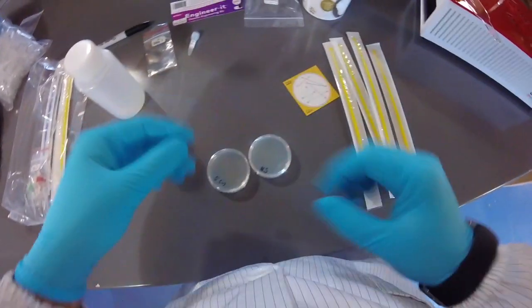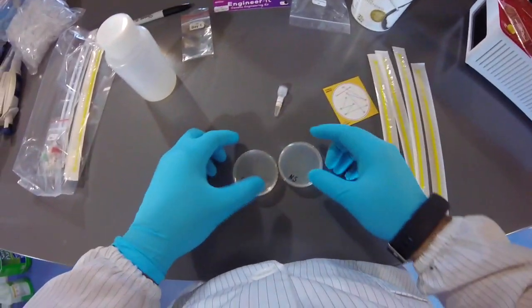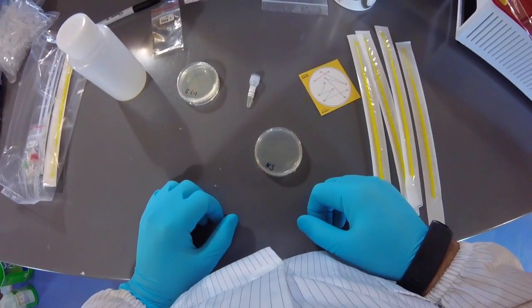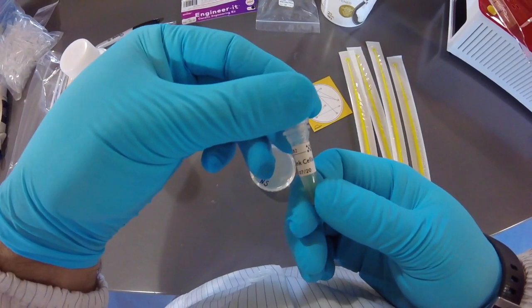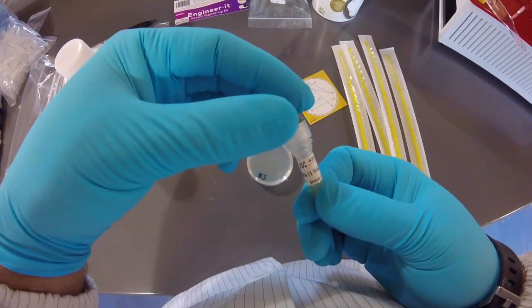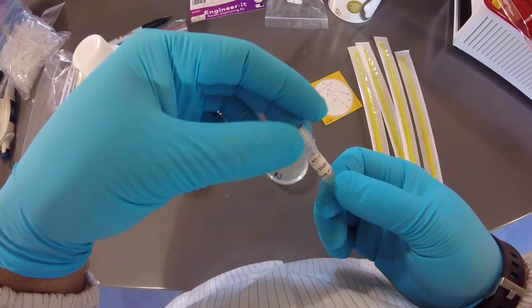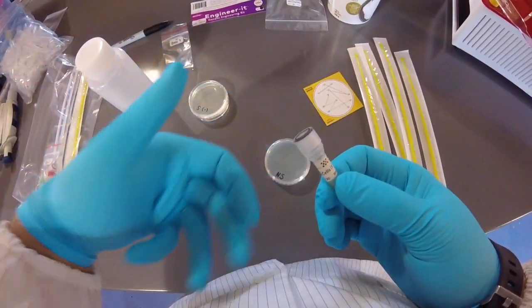Okay, so now we get on to working with cells here. The first one we'll do is the non-selective plate, where we streak blank cells, okay? Again, these are E. coli cells, lab E. coli cells. You can learn about them more in Chapter 3 of the Zero to Hero book. But effectively, they're a basic lab strain that is not engineered with any sort of plasmid.